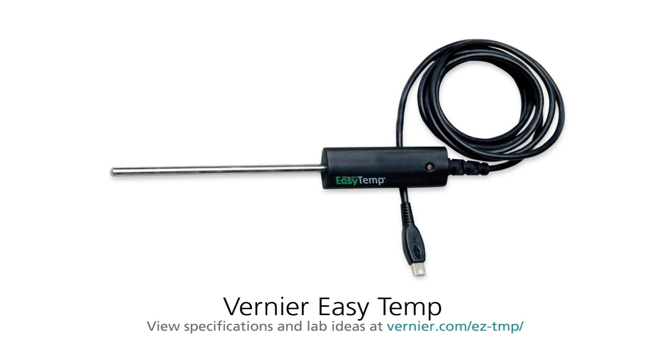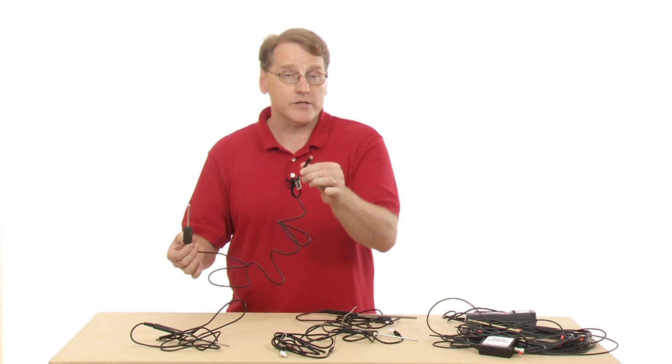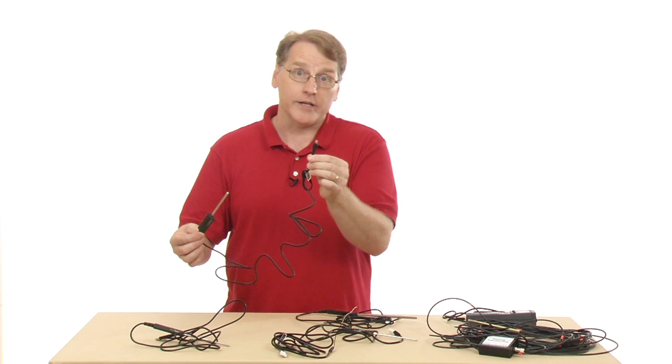Next would be the EasyTemp. And this is a temperature sensor that plugs into the TI devices, a TI Inspire, a TI-84 calculator.